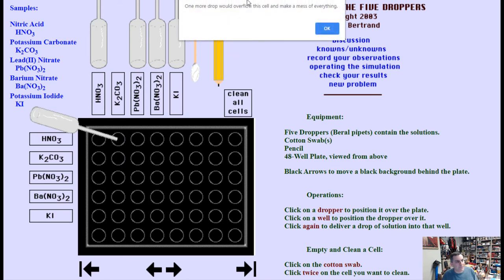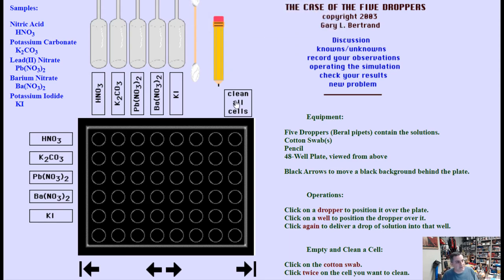If you keep doing this, look, I don't know if you can see that but you get the little warning sign that says hey, you overfilled it and now you made a big old mess. I thought that was kind of cool. So I'm going to clean up my mess, clean it up, and this time I'm just going to put one drop. You need one or two drops, it doesn't matter.